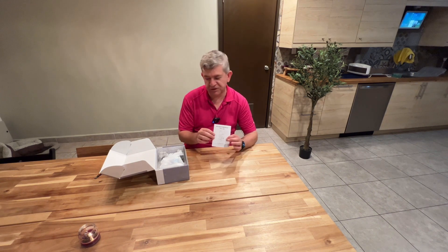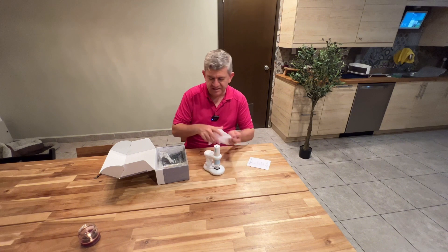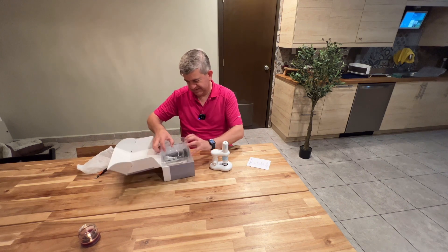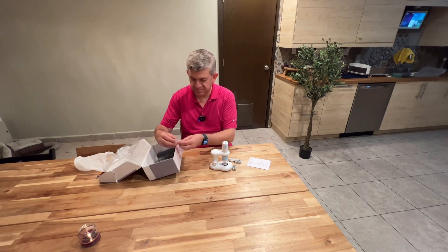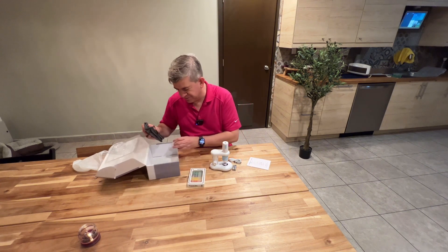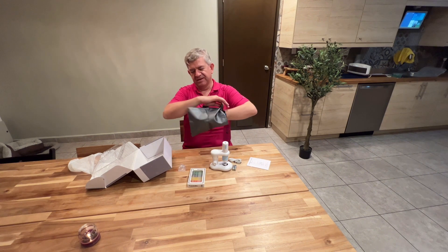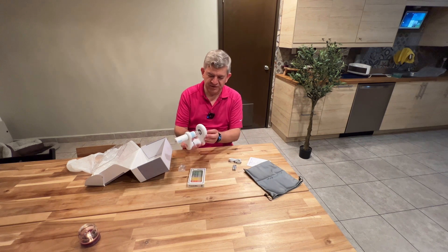It has the general user manual. This is the actual microscope. We are going to charge it with this USB-C port. You have the cable, and you also have some extra batteries and some slides with samples already on them, so you can start looking at things even without trapping anything. It has this nice silver carrying bag, so you get everything you need.